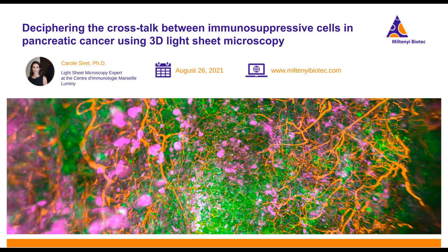So in fact, in human, we identified the interaction on some tumors on paraffin sections. Localized. But in fact, with human samples we had access only to a very small piece of tumor. So the localization is difficult to assess, because it is very small, and we don't know exactly where we are in the tumor.